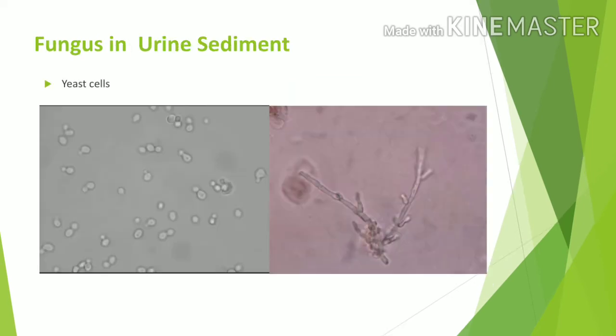Then fungus in urine. The first picture shows a moderate number of budding yeast cells. The second picture shows a single hyphae seen in this field.